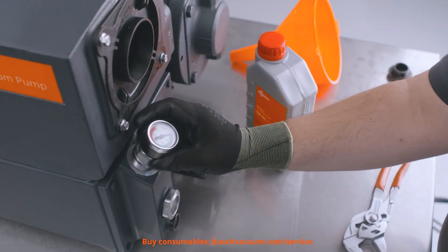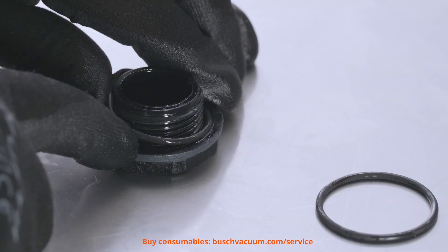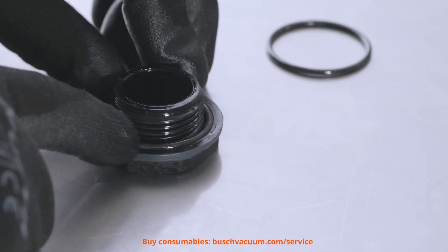The next step is to unscrew the filter pressure gauge to replace the seal and screw on the oil drain plug. If an oil drain kit is installed, the o-ring does not need to be replaced.